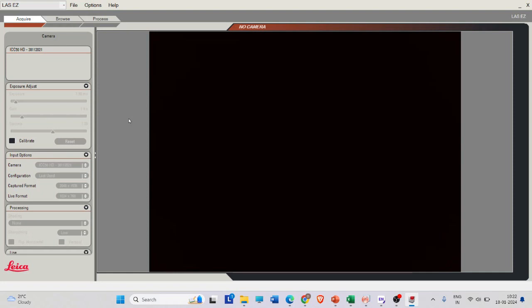This is salicylic acid dissolved in propanol, so write it down. The first sample is salicylic acid, so we'll put it over here.